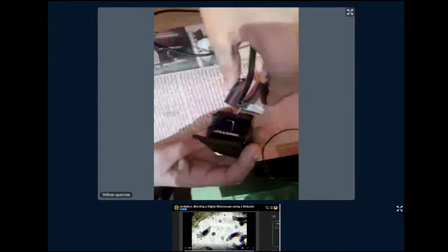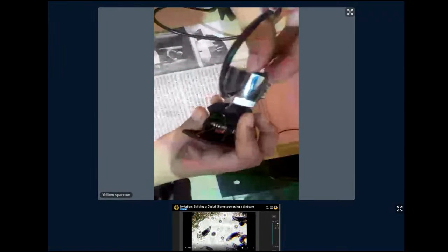Okay. So now, just turn around the camera, the other side, the back side. No, the back side of the camera. Okay. Now, do you see one screw where your thumb is? At the top. Yes. Do you see a screw there? Not on the left hand, left thumb, top corner. Yes, sir.